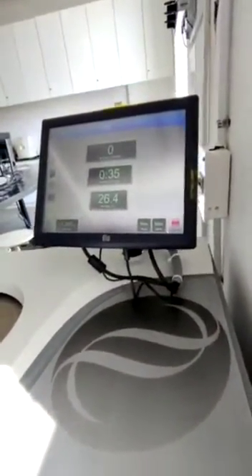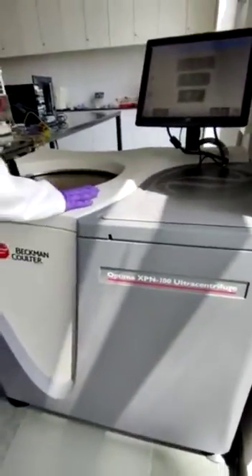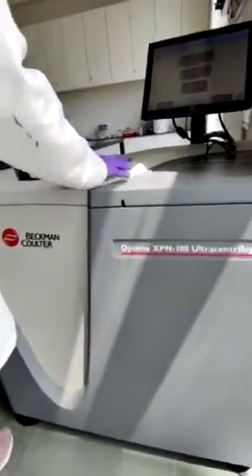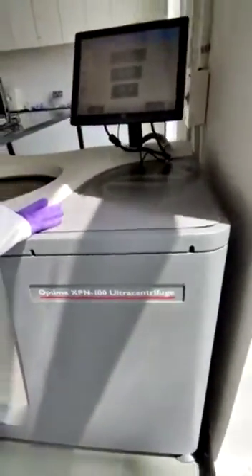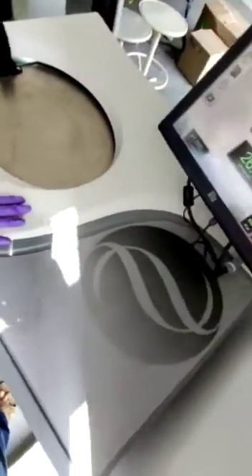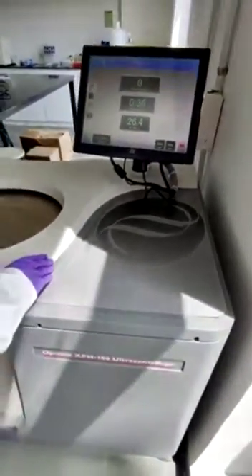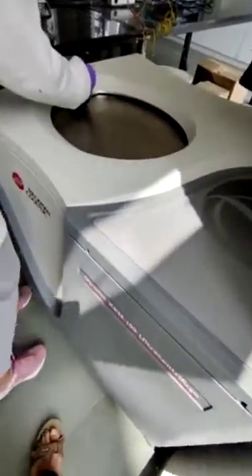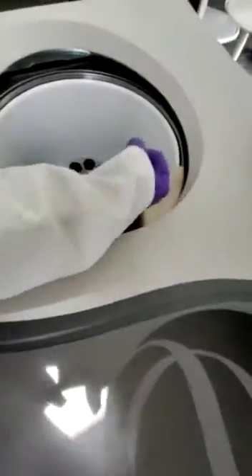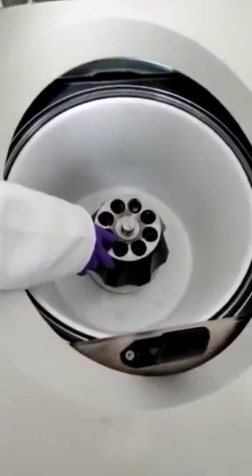This instrument is used for carrying out the process of ultracentrifugation. It uses a specialized ultracentrifuge with optics to enable light monitoring of macromolecules in solution under biologically relevant conditions, capable of detecting particles at low concentration with minimum buffer constraints in a matrix-free environment where no standards are required. It is equipped with an absorbance and interference detection system, and the chamber contains the rotor, optic systems including a lamp, reflectors, lens, and photometer tube.